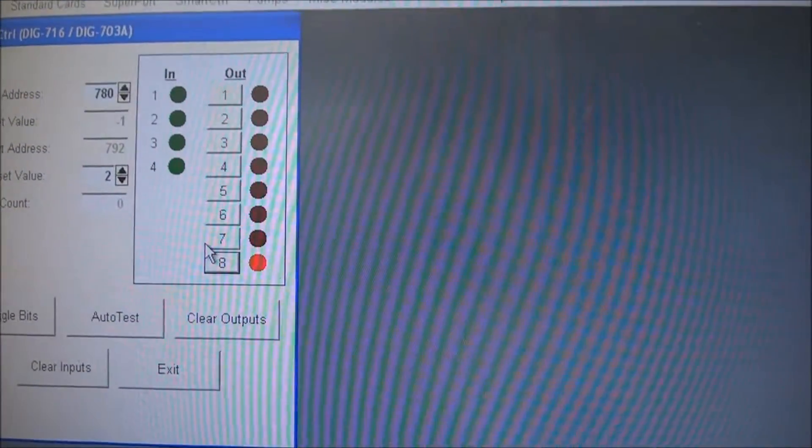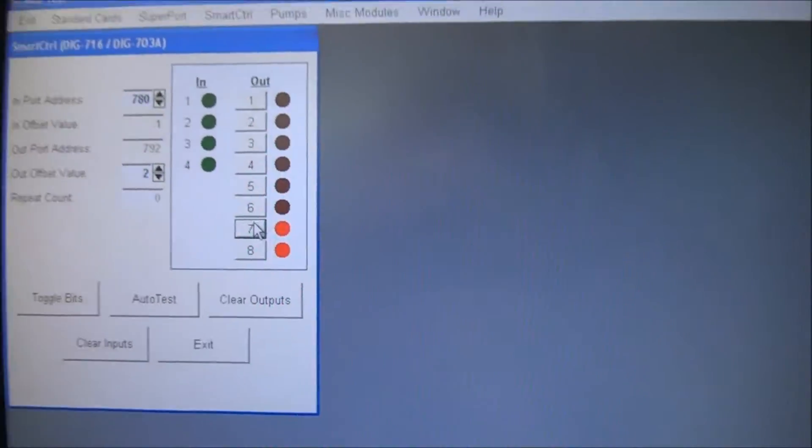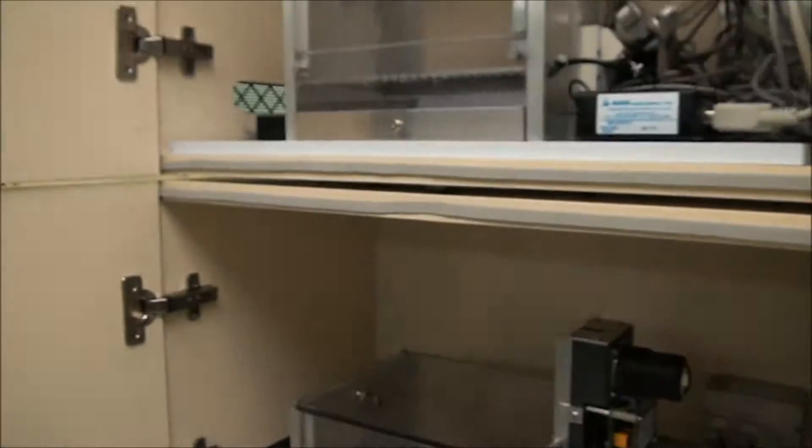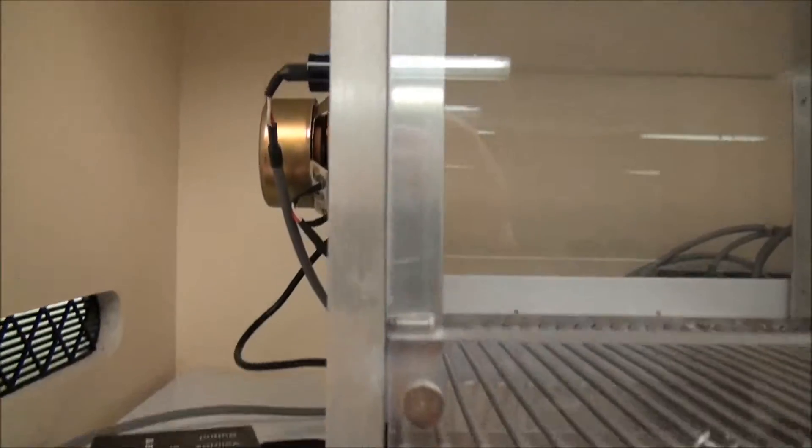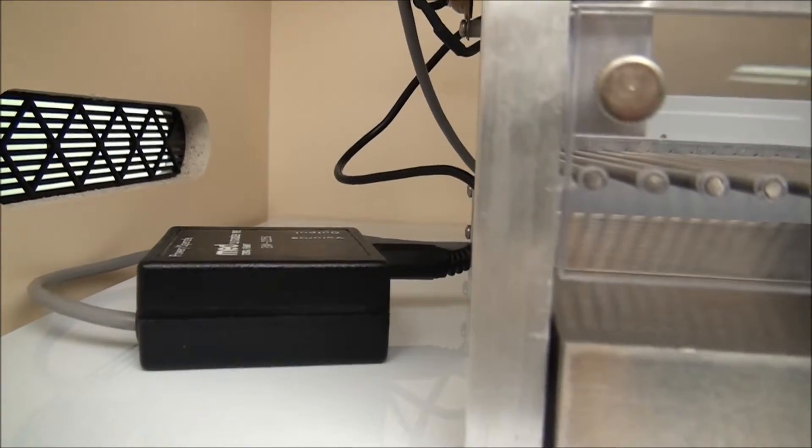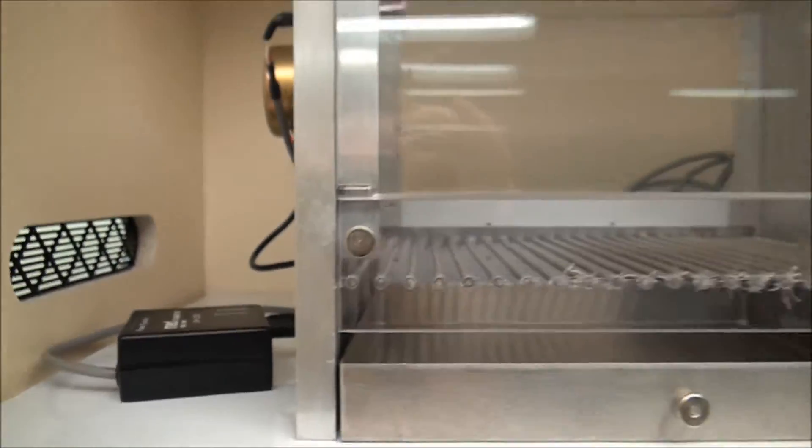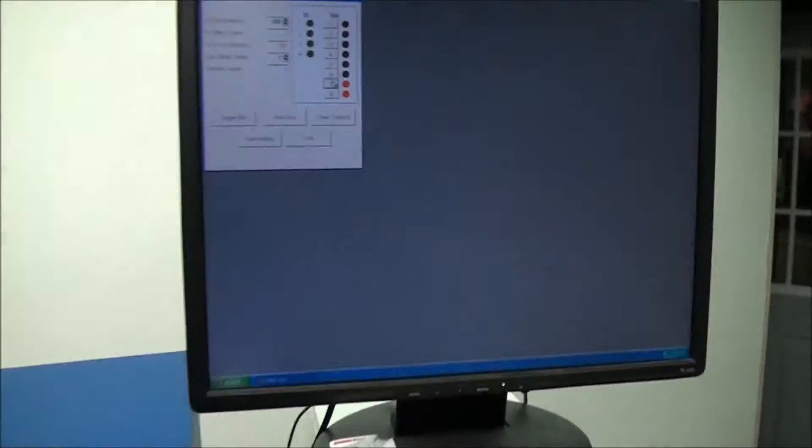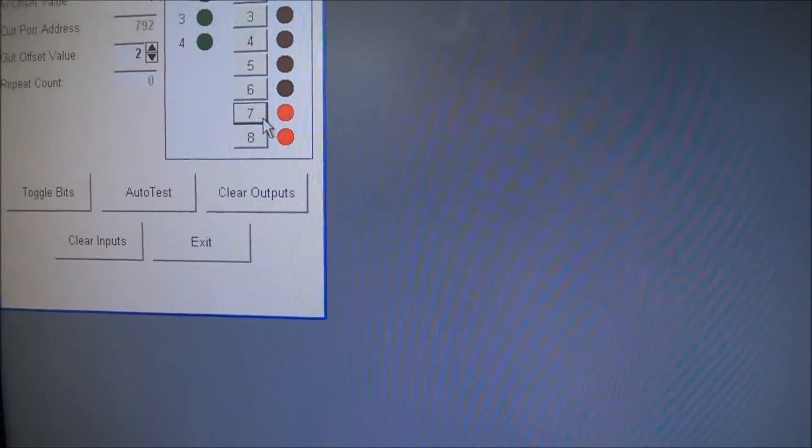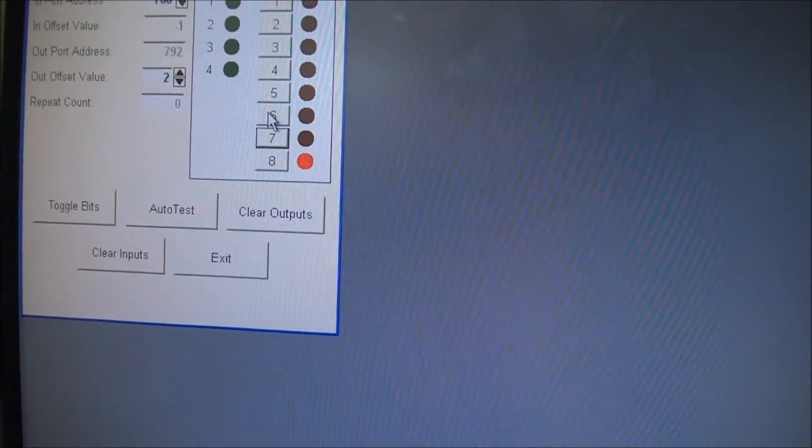But that's throwing power over. And then I'm going to go ahead and turn this one on. You might have heard that. That's actually the speaker that was just turned on up here. And we can turn the volume up or down on that control box there. I'm going to go ahead and turn the speaker back off here. See that shut off.